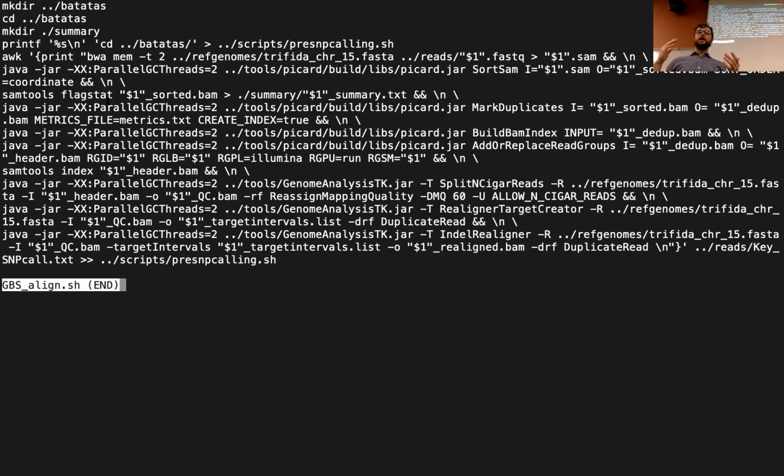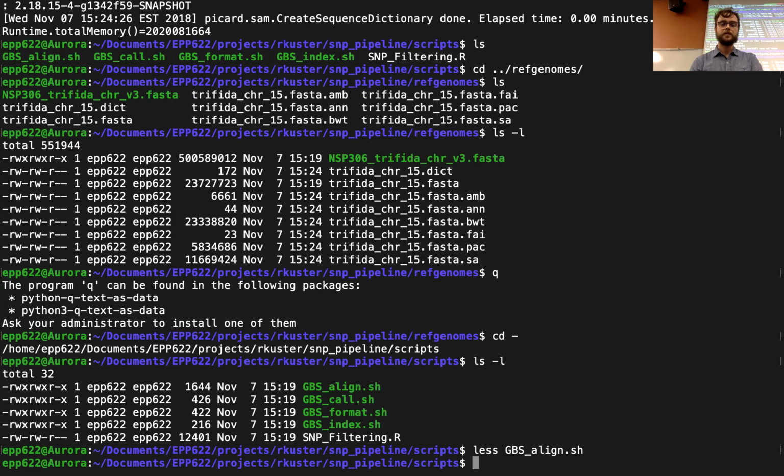So I showed you that SNP call file earlier, just the text file that had the names of those 5 hexaploid genomes, or reads, that we're interested in looking at and aligning to our reference genome. So for each one of those file names, it's creating all of these commands 5 times. That way you're not typing one sample at a time. You automate it.